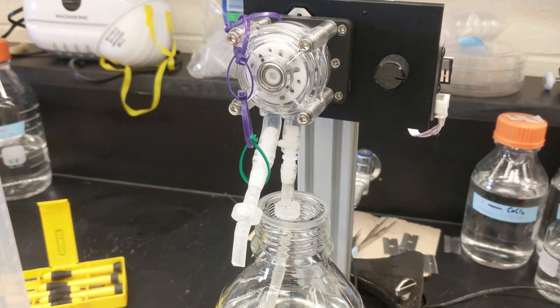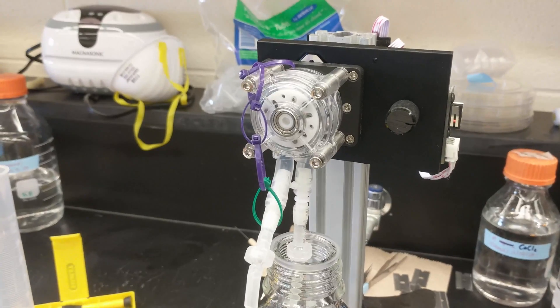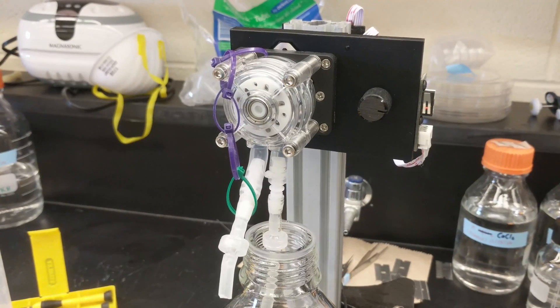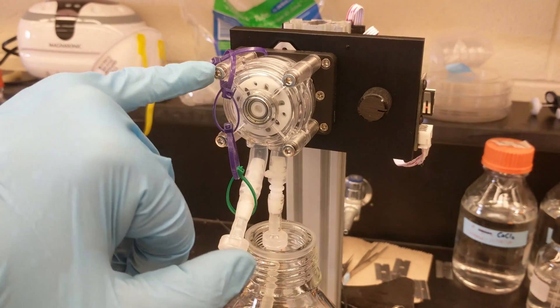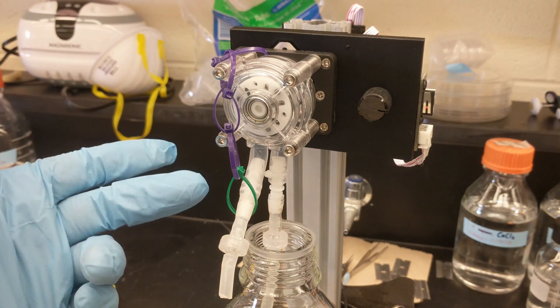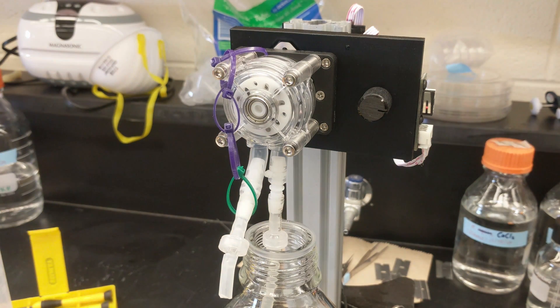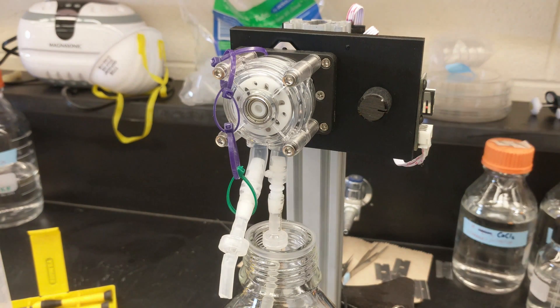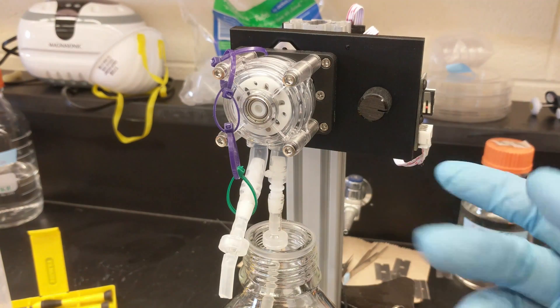That's essentially all it is. The cost for parts is very very low. The pump was the most expensive part at about 60 bucks. The controller and the easy driver I would say maybe 15 bucks. The switches and the potentiometer, everything I had lying around. So you know, for 80-90 bucks you can actually have a pretty good liquid dispensing solution.